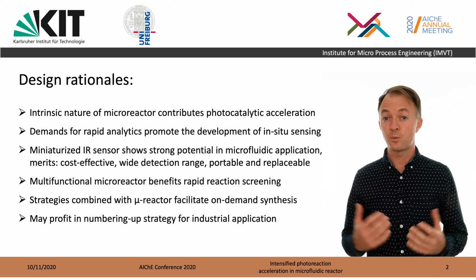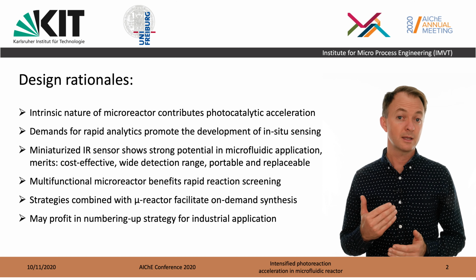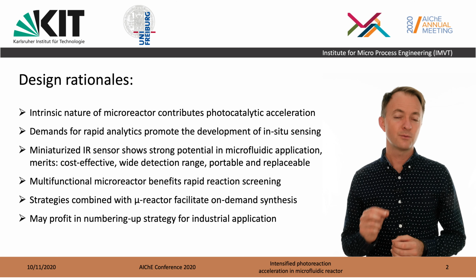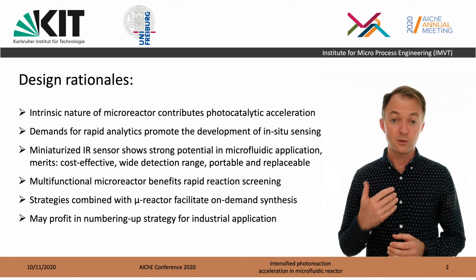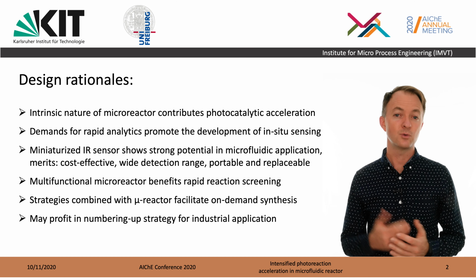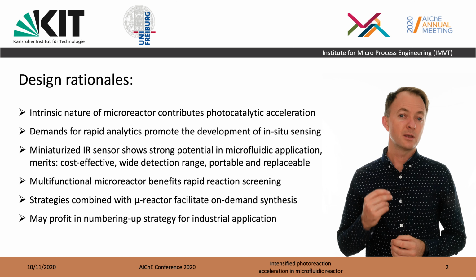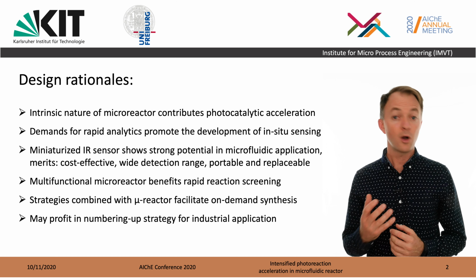The ways in which microreactors are progressing means that there's more of a demand for in situ analytics. That means that we want to know within the flow reactor exactly what the local concentrations are, so that we can control the reactor better to get better productivity and especially better selectivity for complex chemical reactions. One way that we are going about trying to solve this problem is by using in situ optical sensors.